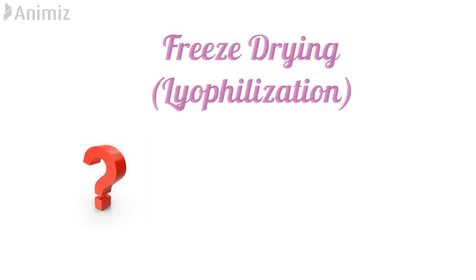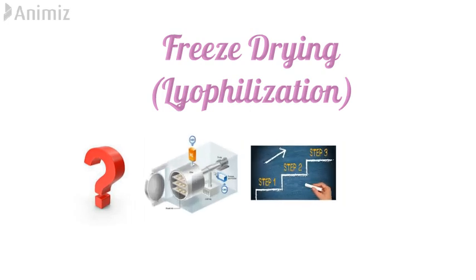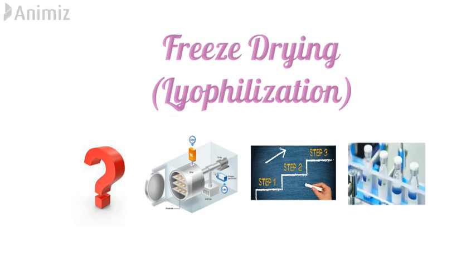Today's topic is freeze drying or lyophilization. So let's see what is lyophilization, what are different parts of a lyophilizer, what are the different steps of the lyophilization process, and what are its industrial applications. So let's start the video.